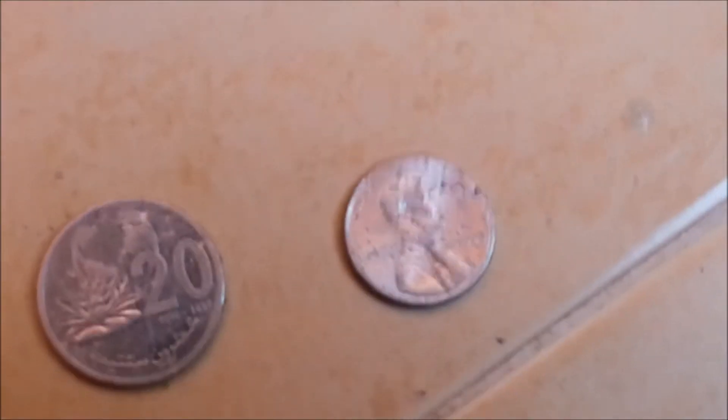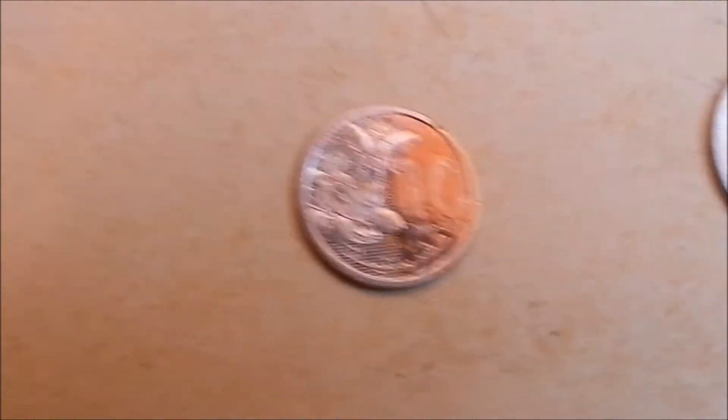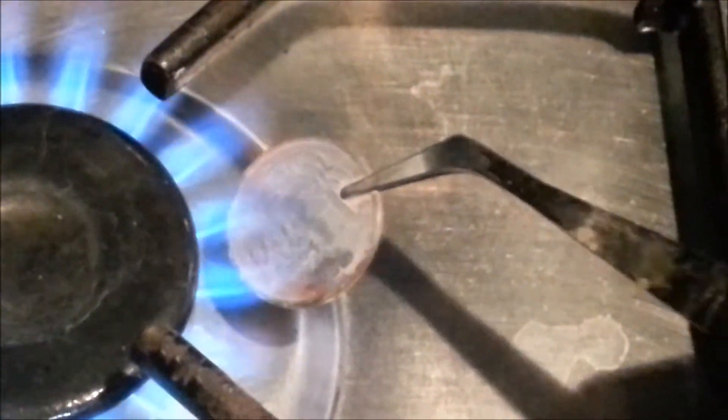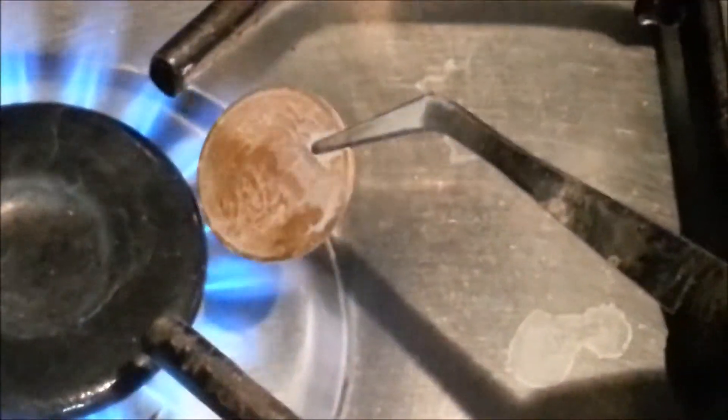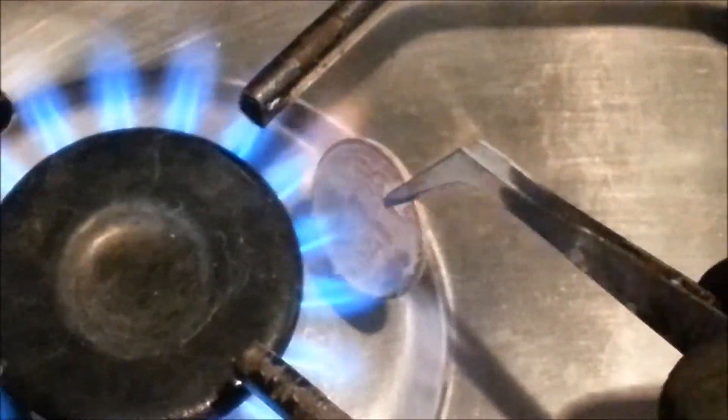The zinc is responsible for this metallic silver color. Now let's heat the coins to make them look like gold. We take the coin and put it in fire at about 200 degrees Celsius, and we can see the color start changing into a golden color.